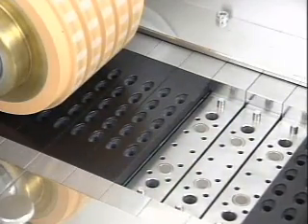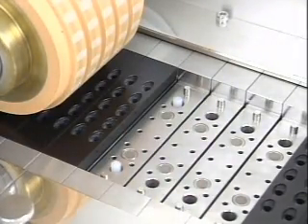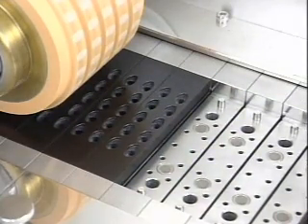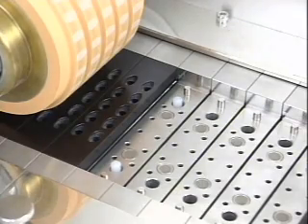The slat is automatically attached and detached by using a magnet. This makes it possible to shorten the time in case of changing the tablet form or exchanging the slat when washing. This method is superior in operation, reproducibility and washing validation.